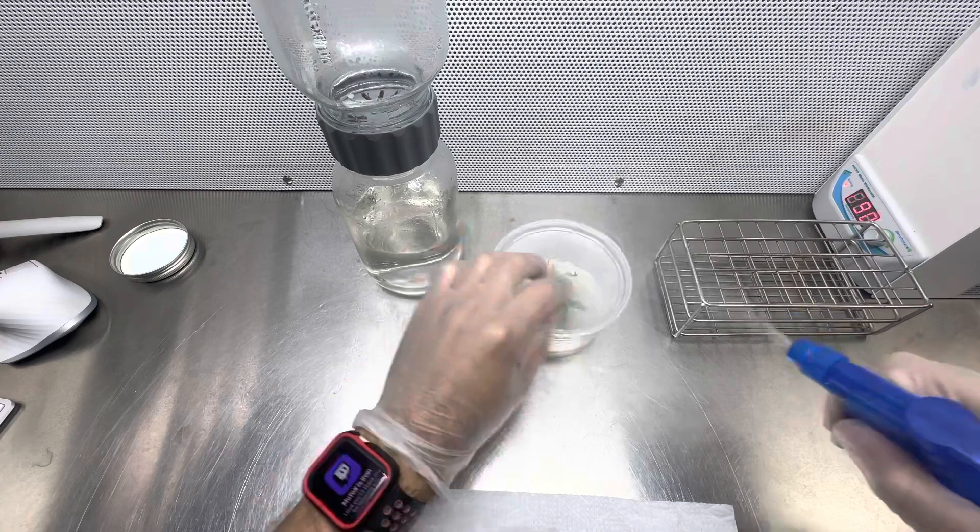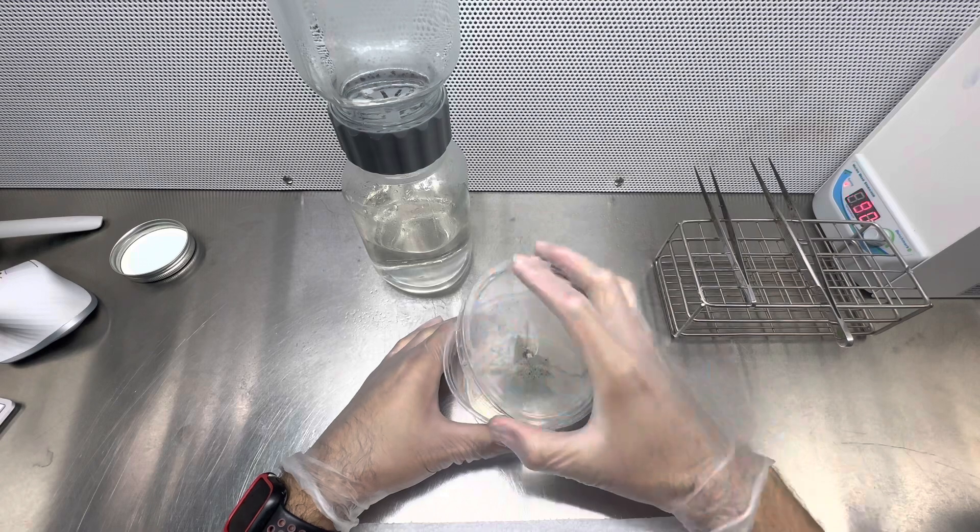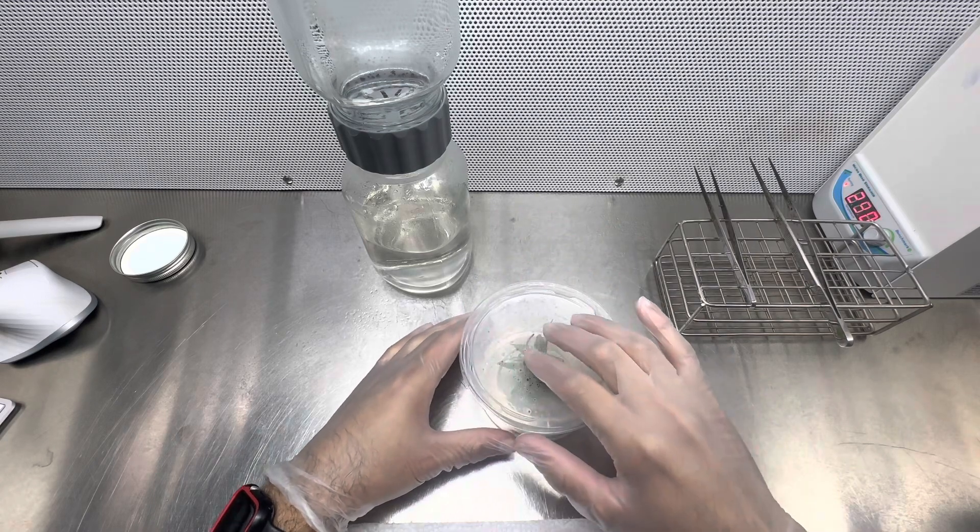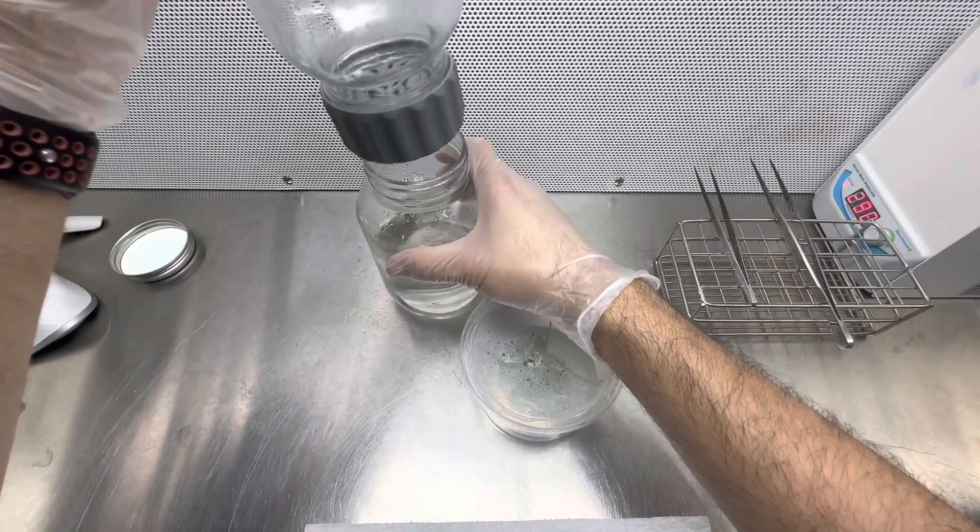Now it's time to move the plant to the biocoupler. First, I spray it with some isopropyl alcohol again to keep it sterile. One tip I have is do not place the plant in the top glass jar as it's going to be more difficult to do.